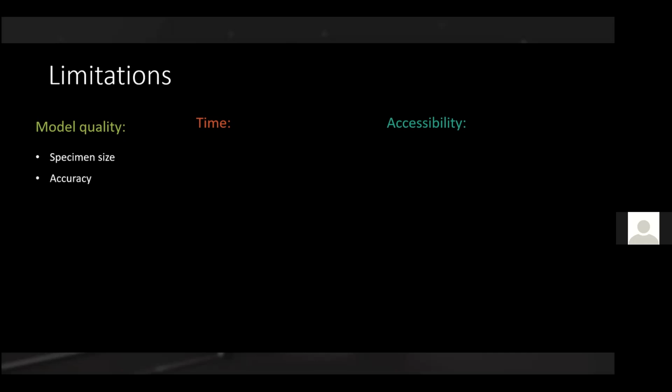The second one is accuracy, and it's difficult to give a good figure for this because there are multiple ways in which one can think about it. The main problem is, what is the ground truth you're comparing to? You need something with very well-known dimensions to say something about accuracy. We reconstructed gauge blocks that have very high precision tolerances in manufacturing, and they suggested that in these instances we have a reconstruction accuracy of about 10 micron.